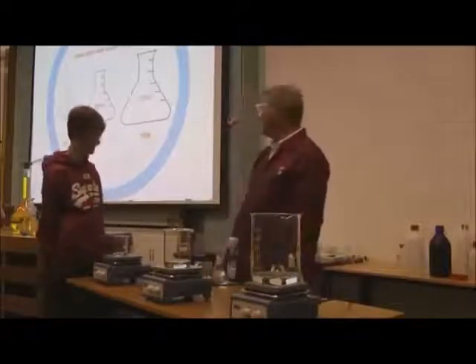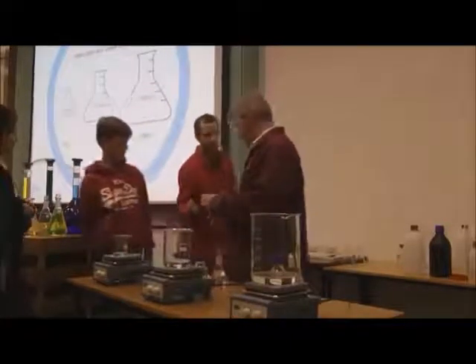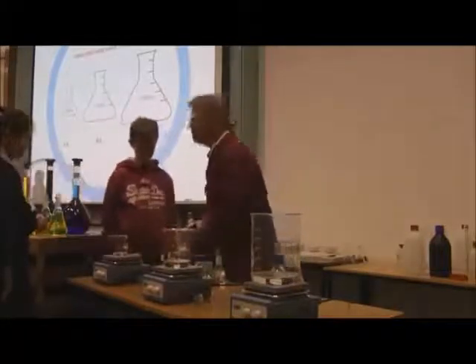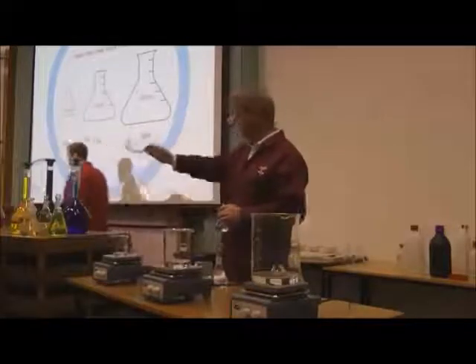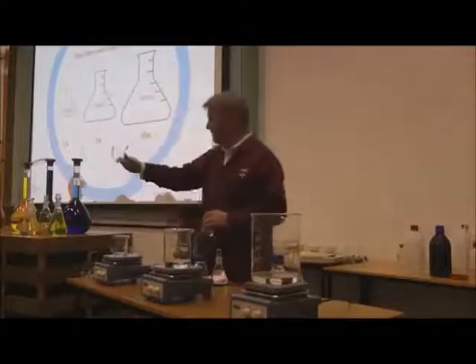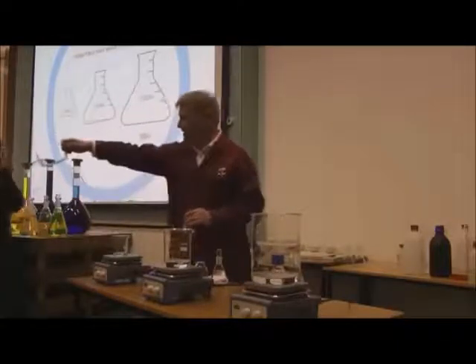Okay. We've got glasses. Glasses and gloves. If you set these people up whilst I just prepare this. Okay. Right. We'll better get some safety gear for it. So if you just stand there. Okay. Right, there you go. One for the large, one for the medium, and some snazzy ones for the small. Okay, you actually become small now. Okay. When you're down here. Alright? Thank you. Your medium, and there's some big glasses for the large.